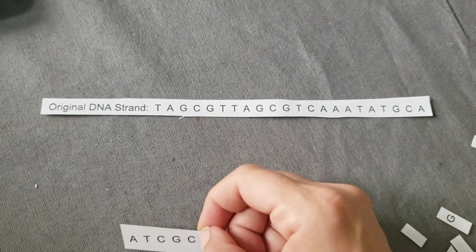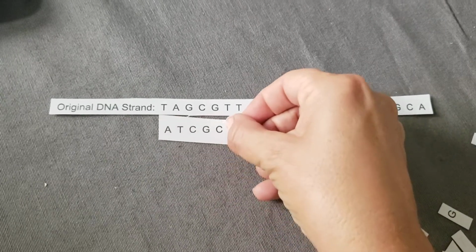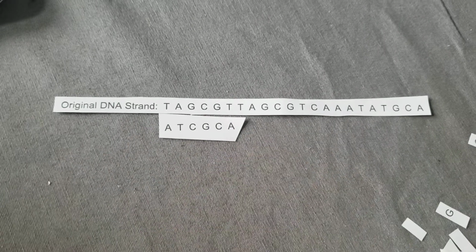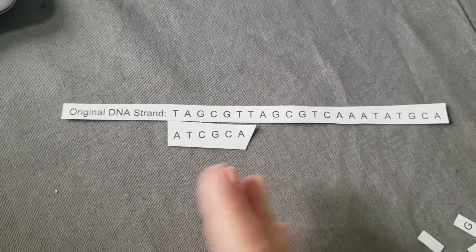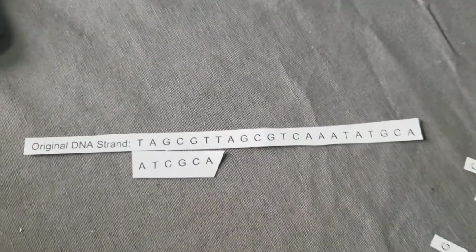Let's say Sue's actually sick with something else. So your primers that you suspect might attach, let's just say we suspect something other than the flu. We've put primers in place specific to that suspicion, and they actually are attaching in the tube inside of our machine. Okay, so now what happens?